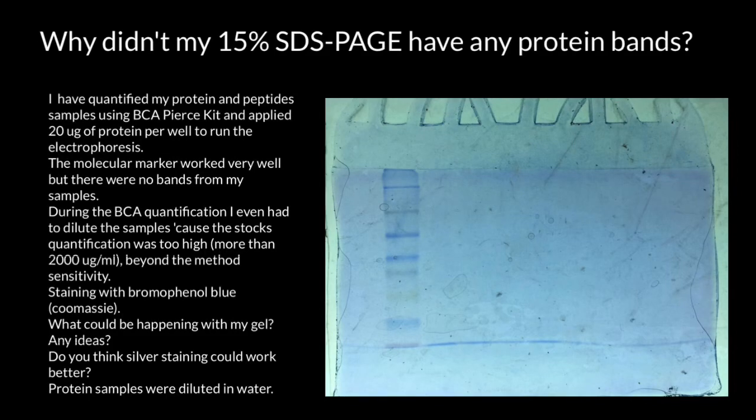Hello and welcome to Nikolai's genetics lessons. Today we have another case study which I call 'What's Wrong with My Gel Electrophoresis.' Here's the topic of the day: why didn't my 15% SDS-PAGE have any protein bands?